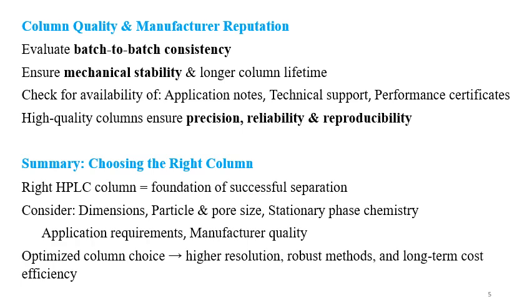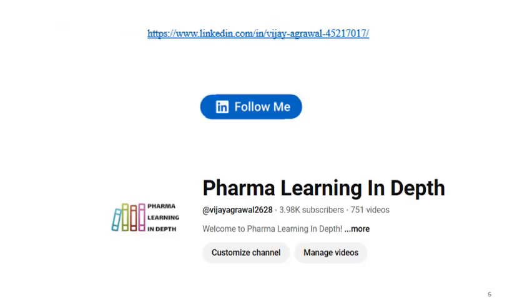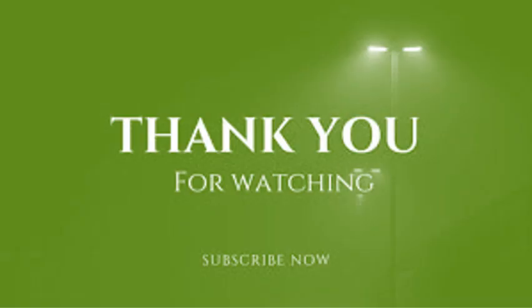Whenever you are going to choose the column, always correlate the method requirement, correlate the analyte and its chemistry, and what you are going to do with the column. Based on that, you can select the right column. If your column itself is wrong or not suitable for the method, then you cannot get good results.